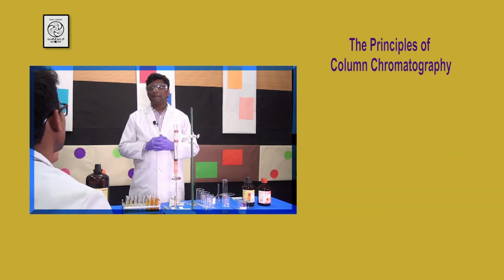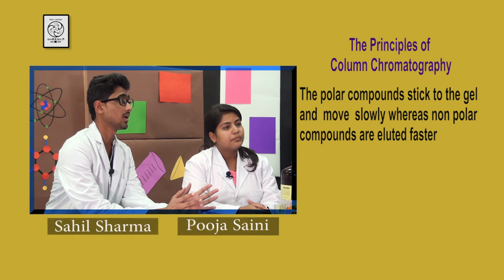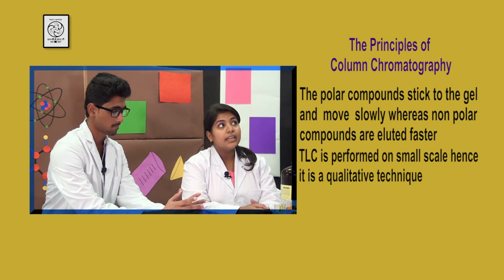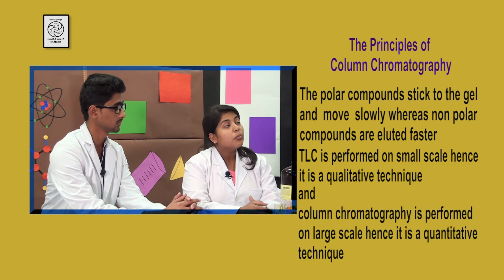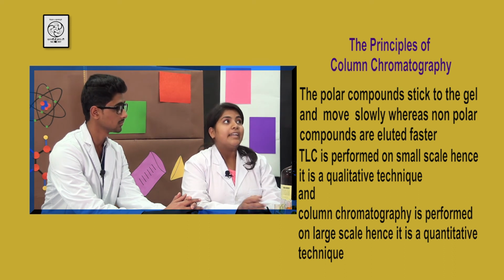Sir, we also learned that the polar compounds stick to the gel and move slowly, whereas the non-polar compounds are eluted faster. Good. We have also learned that TLC is performed on small scale, hence it is a qualitative technique. Yes. And column chromatography is performed on large scale, hence it is a quantitative technique.